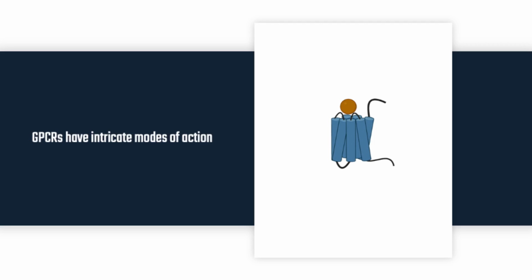Another source of challenge can be their intricate mode of action and the possibility to have multiple binding sites. Whether you are willing to understand their mode of action or find new hits, you may be looking at target agonist or antagonist, but also binding on an allosteric site. And you need to make sure that the conformation of the protein is well preserved. Similarly, in this case, it is really crucial to measure them with as minimal impact as possible on the conformation. And when using immobilization-based technology, you must ensure that your immobilization or regeneration procedure won't impact their native structure or their environment.